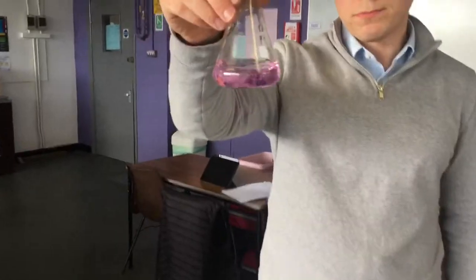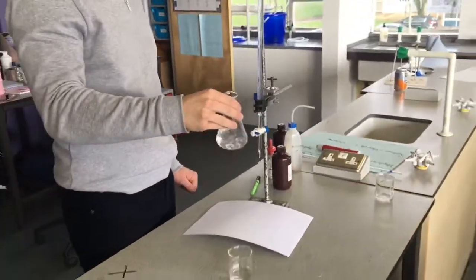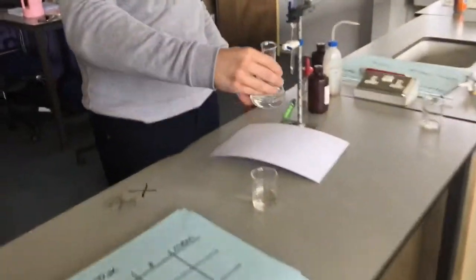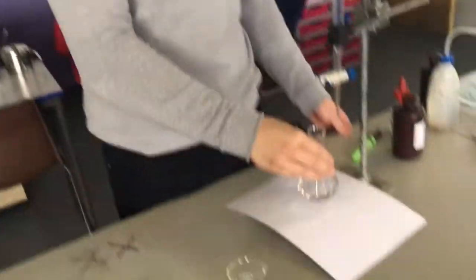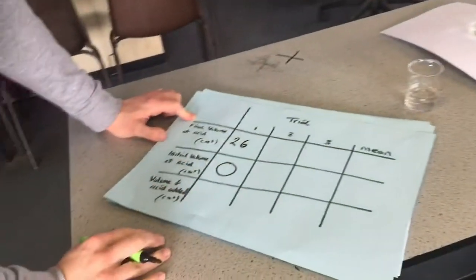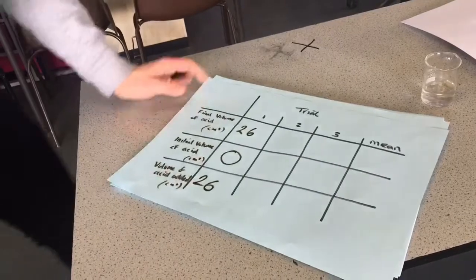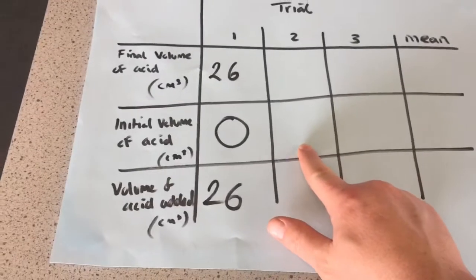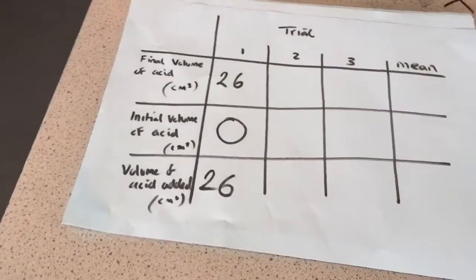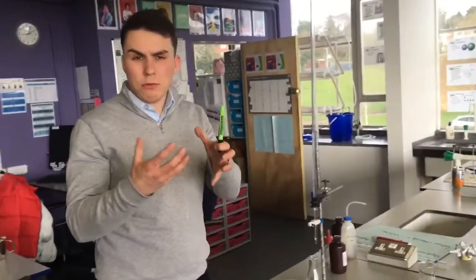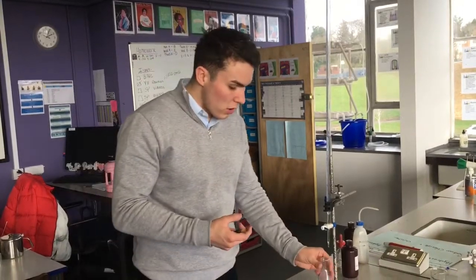There we are — there's a very slight tinge of pink. I've actually gone a little bit too far there; that's an inaccuracy modelled by me. If I kept running it, you will notice all of the pinkness has now gone. So the demonstration went in at about 26. My final volume of acid was 26, which means my volume of acid used was 26 — I take my final minus my initial. If you started the next run at 26, your initial volume would be 26, and if your final was, say, 40, it would be 40 minus 26 as your difference. We saw just how close the margins of error are — I probably added just one drop too much and nearly all of my pink tinge went.